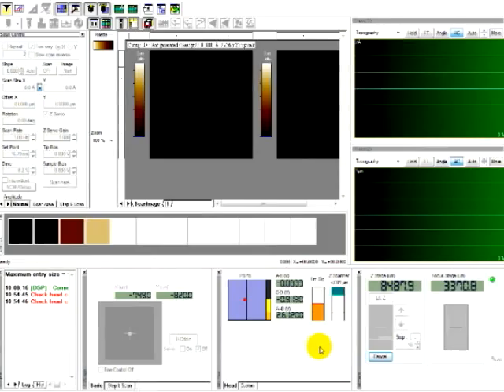As you acquire a non-contact image, you can also check other signals by clicking on input configuration. As soon as approach is done, all those icons will be activated. While approaching, none of these icons will be activated at all.